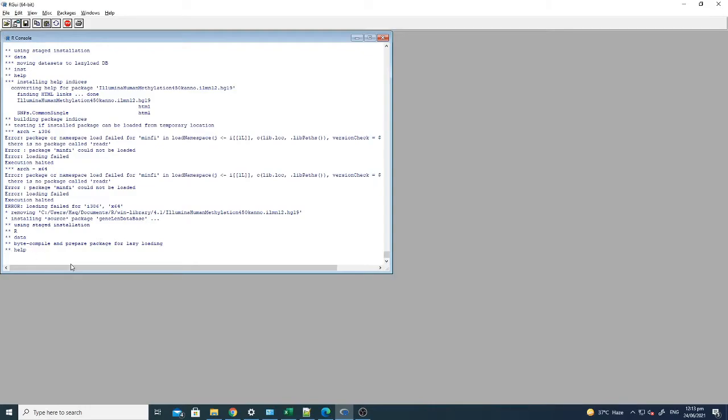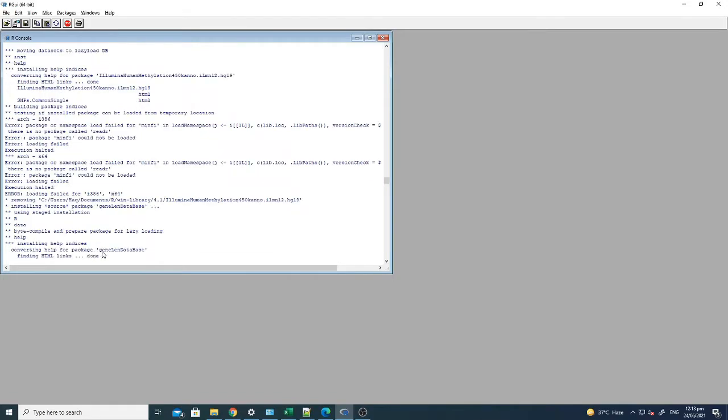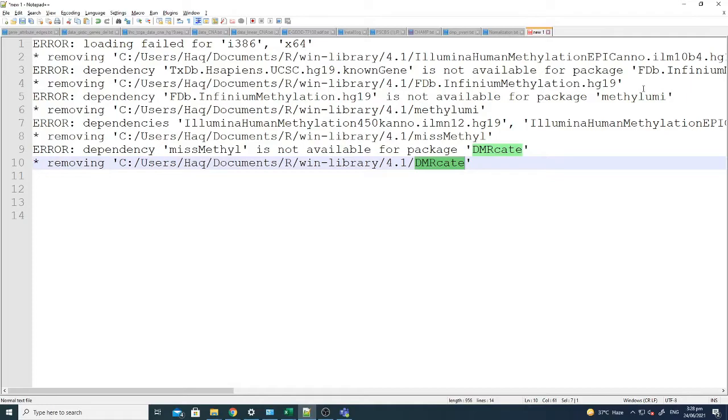We have to identify why this is not installed, so we will manually or separately install the minfi package for the smooth running of this software, that is CHAMP. Also, there was one error when I ran the command. The main package was missMethyl, which is not available for dmrcat, and dmrcat was actually the main package which we need to install.